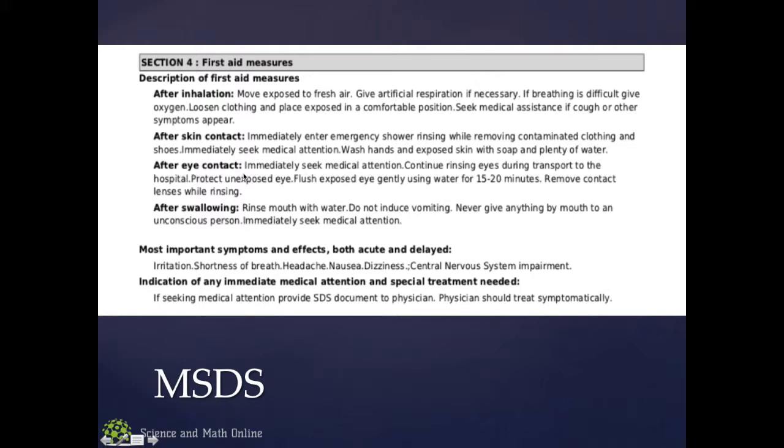Okay. So once again, as I said in the last lesson, be selective. I don't like having to worry about my students and all of this stuff. So I'm generally going to use chemicals that either A, I know exactly how to respond to, or B, I know aren't going to be that dangerous. When I give my kids 1 molar hydrochloric acid, 1 molar is not really that concentrated. If my kids get it on their skin, they go to the sink and rinse it off. And it may leave a slight red spot if they left it on there too long, but otherwise they're going to be okay. I don't give them things much stronger than that because I don't want to deal with the safety risk. And there are ways to modify those risks.